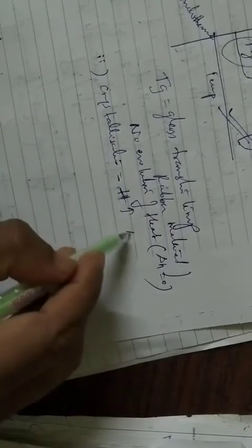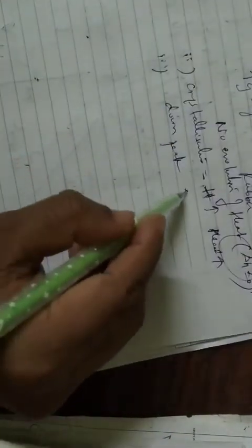Second, in crystallization, the heat is increased here, which is why the upward peak comes. So in the crystallization process, delta H is not equal to 0, and there is an increase in heat. The third is the down peak, which shows that it is an endothermic process.